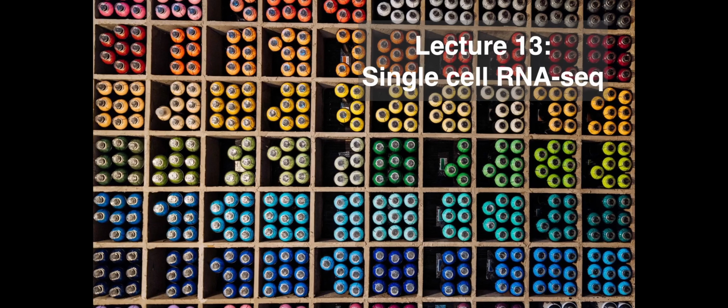Okay, so if we click on the lecture card for today, I want to take a minute just to review our learning objectives. I want you to understand droplet-based technology and how it allows us really to carry out not just single-cell RNA sequencing, but in fact, many different kinds of assays on single cells. You'll be able to compare and contrast single-cell and bulk RNA-seq methods by the end of these lectures.